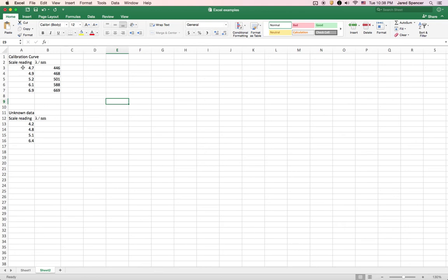Okay, so the way that we do that is we grab and select the entire set of data. I see that this is not highlighted. This is kind of an eccentricity of Excel. Everything inside of the green box is actually highlighted. It leaves the original cell that you clicked unshaded. I'm not sure exactly why it does that. I'm sure Microsoft has a good reason for doing things this way, but all of this data is actually selected right now.